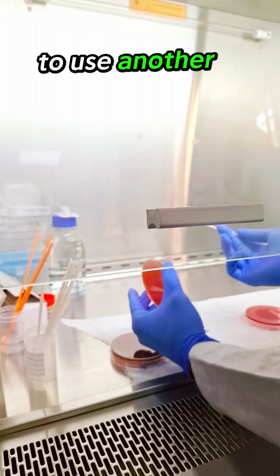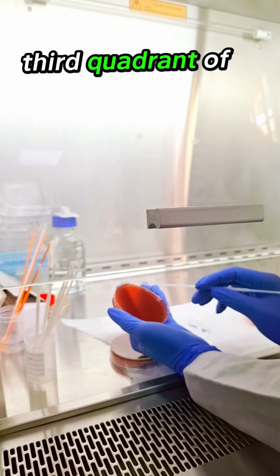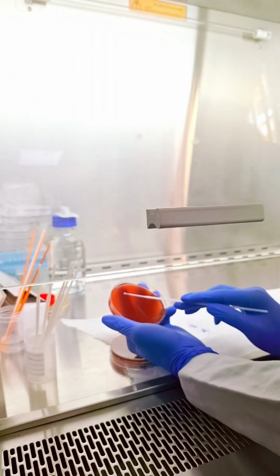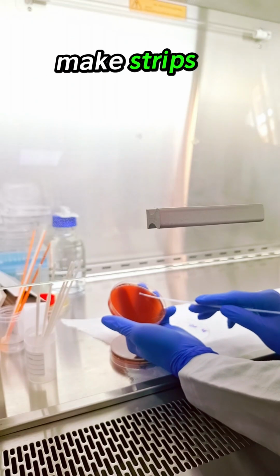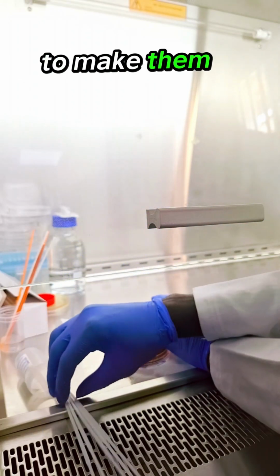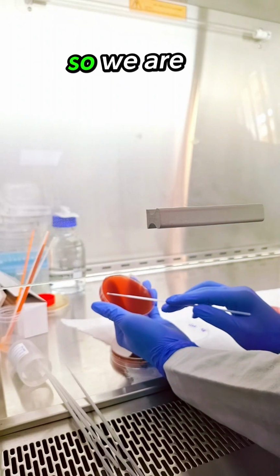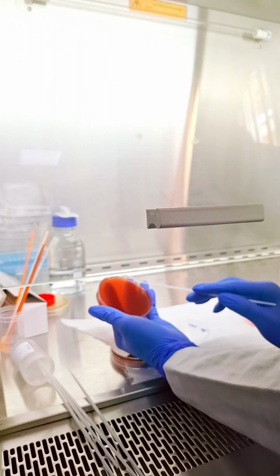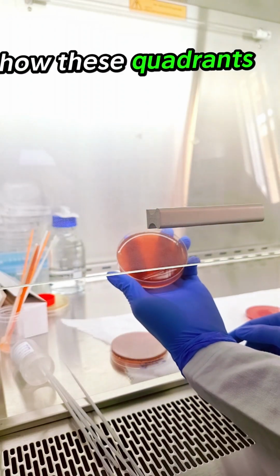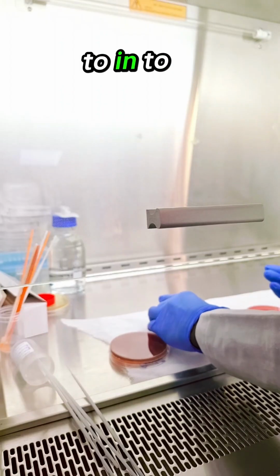Then I'm going to use another loop to make the third quadrant. Of course, you rotate 90 degrees and make more streaks. Then the last quadrant, of course, we are going to make. So we are having the last quadrant here. We are doing it like this. And of course, from this point, you can see how the quadrants look. That one, of course, we're going to cover the plate.